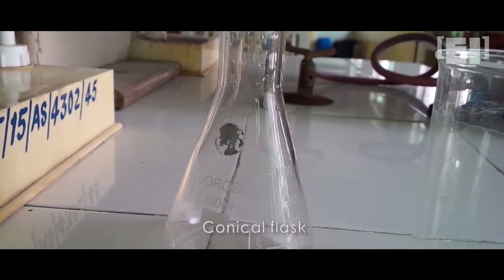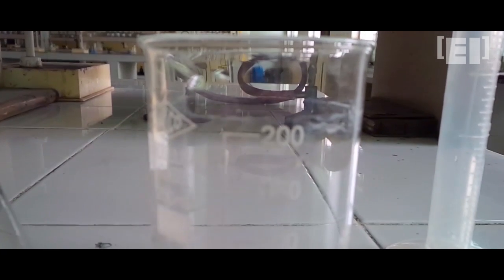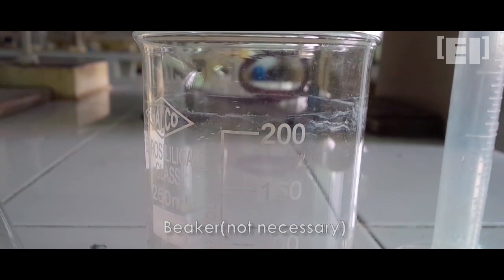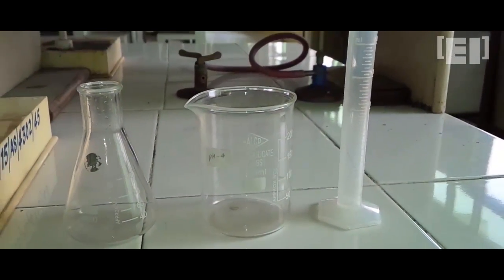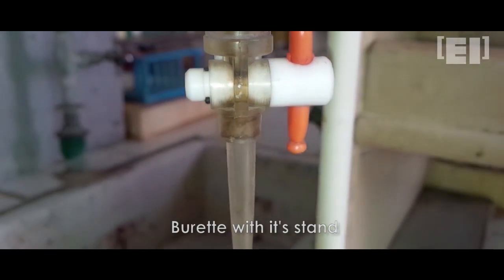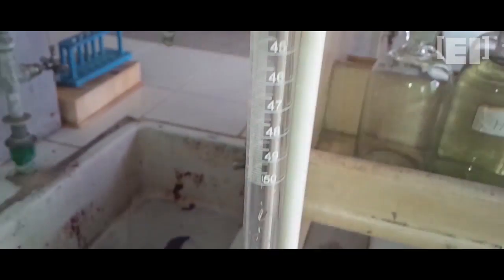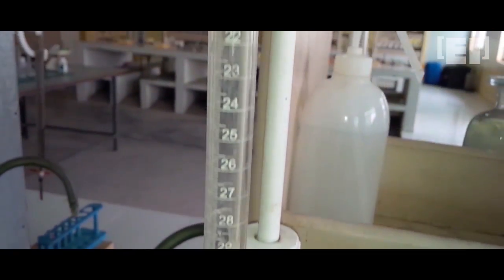The apparatus needed are conical flask, beaker, measuring cylinder, burette with its stand, and a wash bottle.